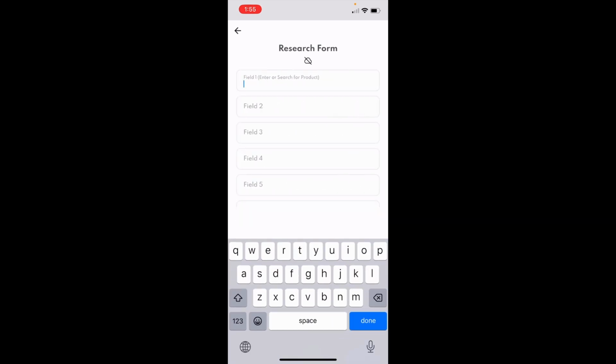In the first field, we can select king salmon, or we could select sockeye salmon. Field 2, we will select any number of fields data for each one of these. This could be tributary, it could be a group, it could be a group identifier, it could be a tank number, but these need to be in the same order each time. So I would recommend having a lookup table so you know what field to fill in each time, because it will just say field 1 through field 6.